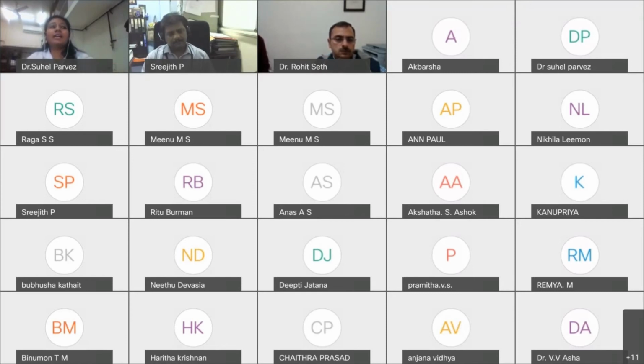We get transgenic lines which already have the GFP fluorescence attached. We have the UAS A beta fly, where we overexpress the A beta 42 protein in the eye. Similarly, we have a GFP line, so we overexpress the GFP protein in a particular tissue by using the driver line. When we cross the flies, the GFP protein will be induced in the particular tissue like gut or eye. Under the microscope, we differentiate which progeny have GFP and which are non-GFP.